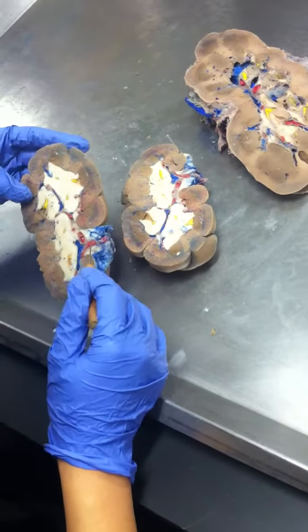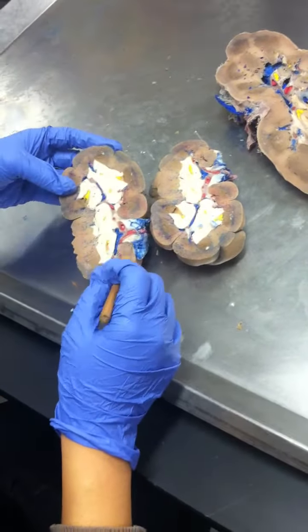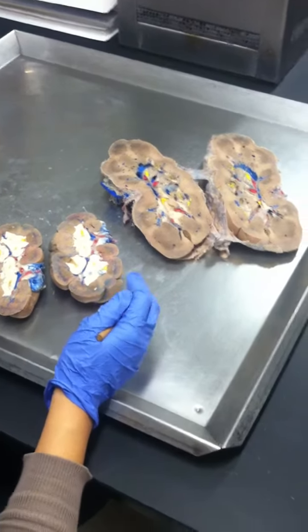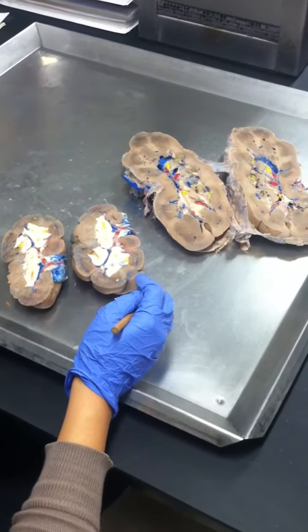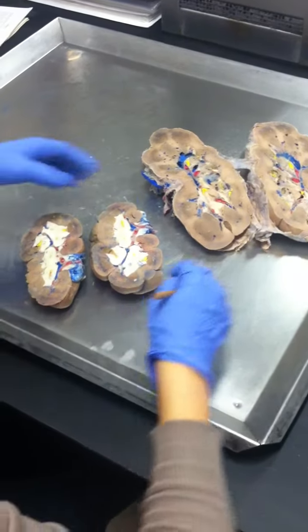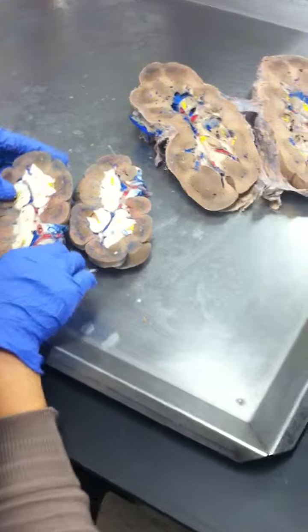It's hard to see the calyces, really. You can't really see that convergence and then go into a structure. It's kind of hard to see that. You will see more of that in the models. So make sure you take a peek at the models, and make sure you know how to match up the picture with the models as well. Okay.